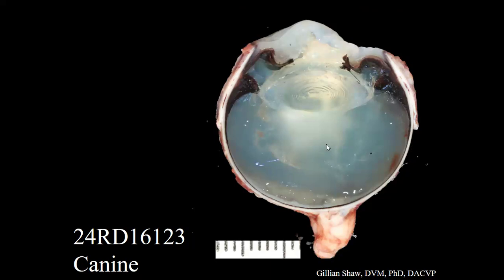So here's the globe hemisected. The cornea is always at the top. There is some translucent gel in the anterior chamber. Here's the lens. The vitreous itself is a little bit hazy. There's a little bit of hemorrhage here and there. The retina seems to be in the correct position.